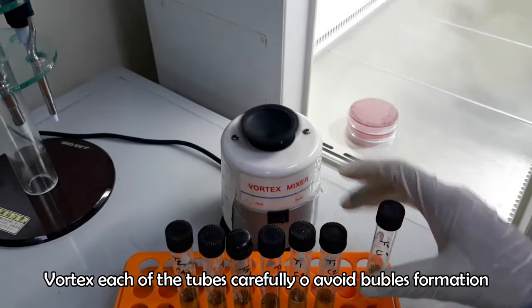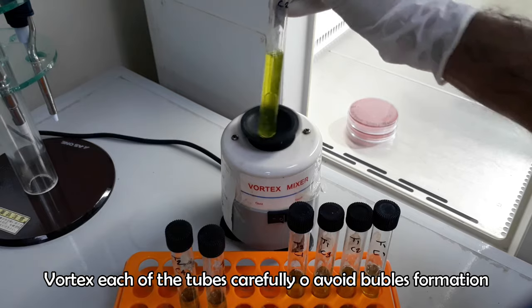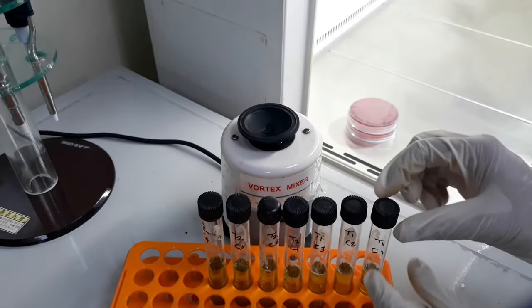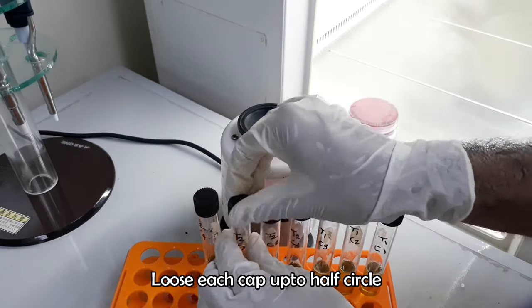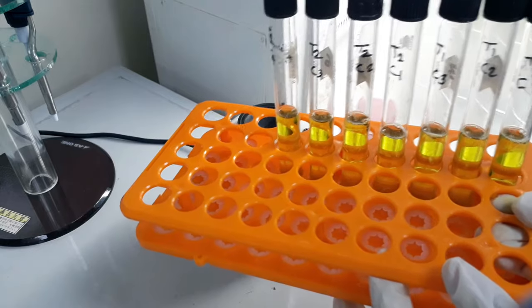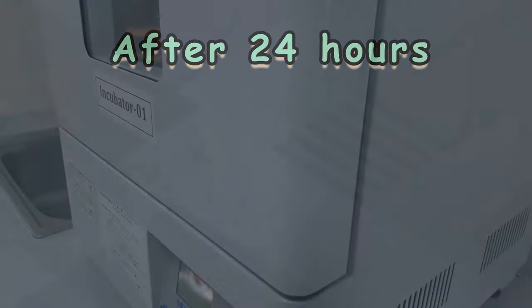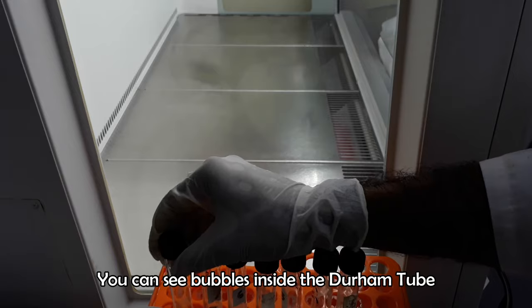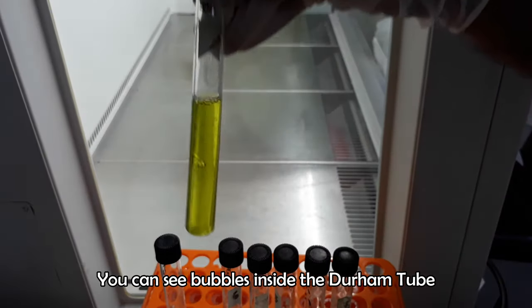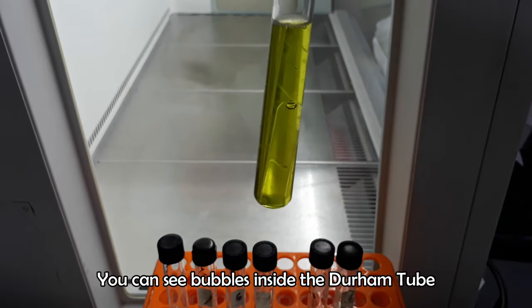Vortex the media carefully to avoid bubble formation. Loosen the cap and finally incubate the media at 37 degrees Celsius for 24 hours. After incubation, observe the tubes for gas formation by the bacteria. You can see bubbles or gas inside the Durham tubes. So the bacteria are confirmed as coliform.